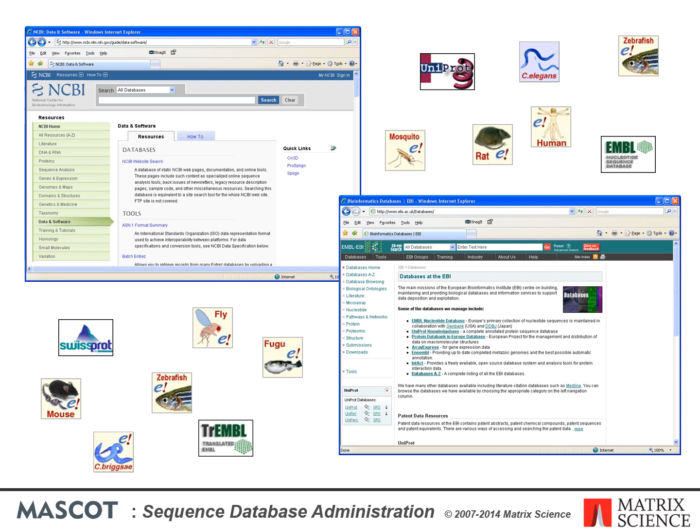Matrix Science doesn't supply sequence databases. Most databases are public domain, and there are a few sites that provide comprehensive database repositories. Two of the best known are the NCBI and the EBI, and here you can download NR, Swissprot, EMBL, TrEMBL, UniRef100, etc. For specialized databases, such as individual genomes, you may have to track down the FTP site of the group that is doing the sequencing. This topic describes the general procedure for adding a new database to Mascot and for keeping it up to date.